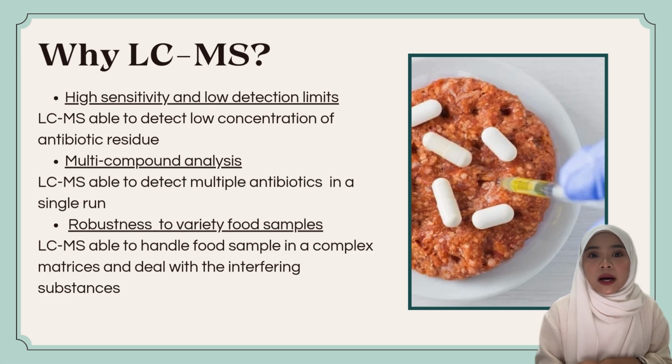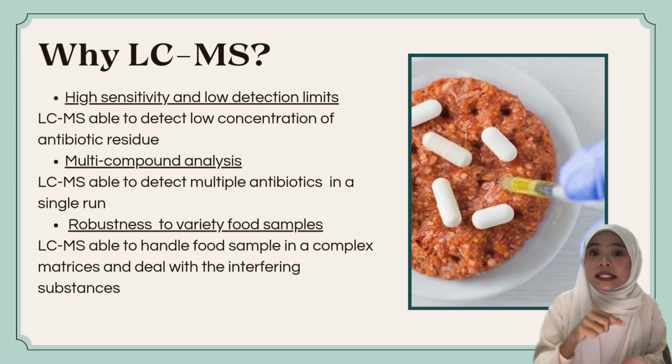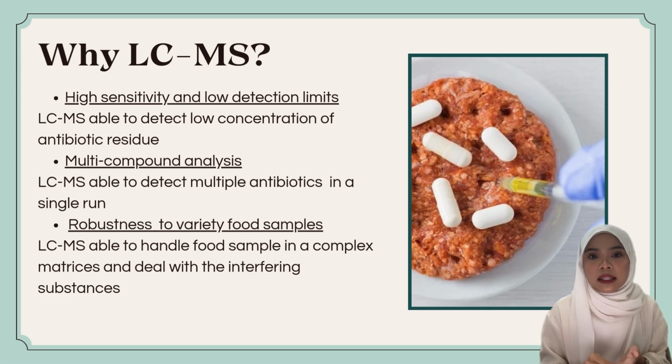Next, multi-compound analysis. In complex matrices, multiple antibiotics or metabolites are present. LCMS allows the detection of multiple antibiotics and their metabolites in a single run. Non-spectroscopy methods usually are specific to one compound, which may require a separate test for each antibiotic.